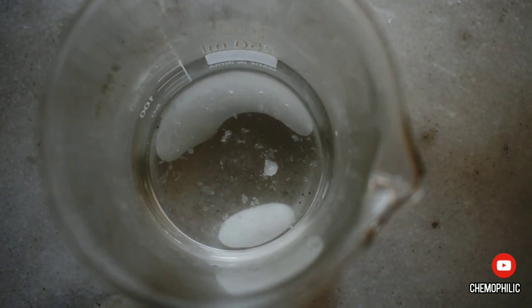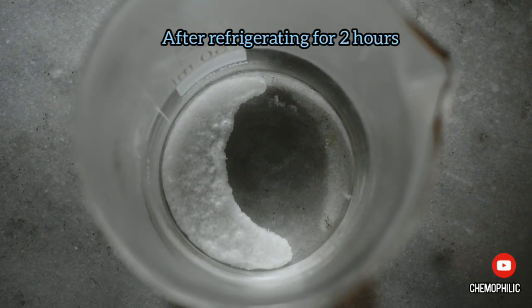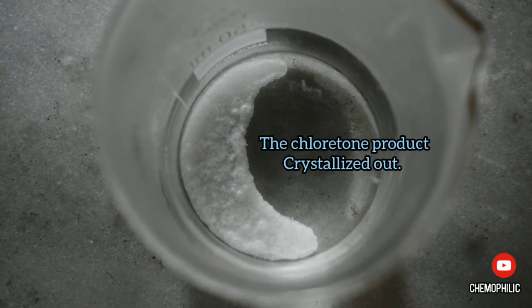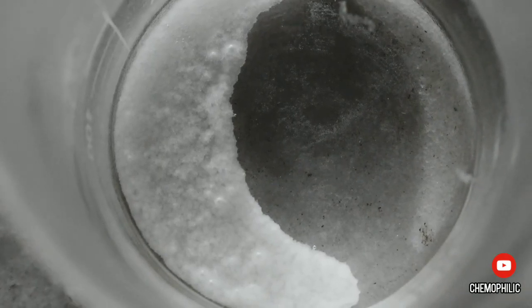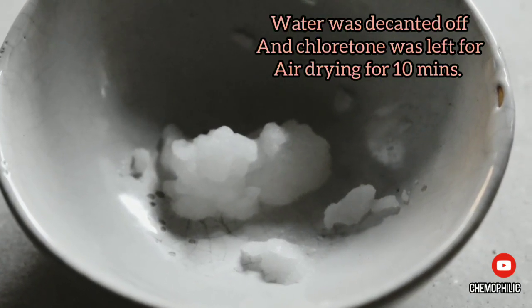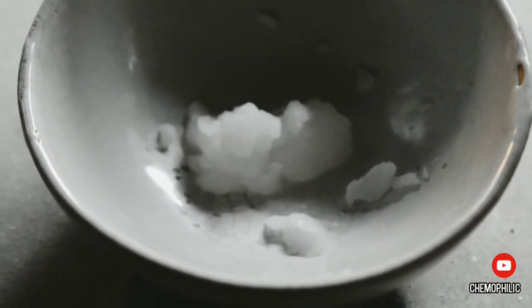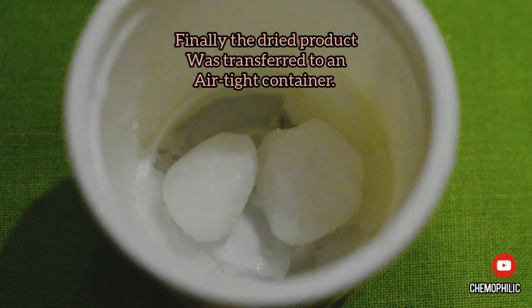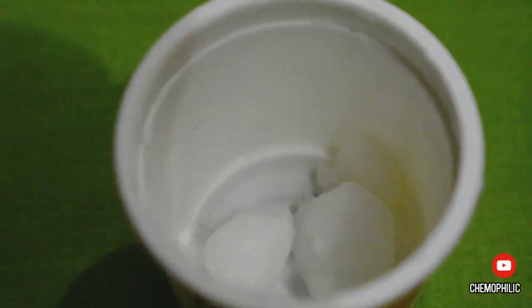Then I kept it in the refrigerator for 2 hours and now the chloritone was completely crystallized. I decanted off the water and chloritone was kept for air drying for 10 minutes. The dried product was finally transferred to an airtight container. My final yield was 62%.